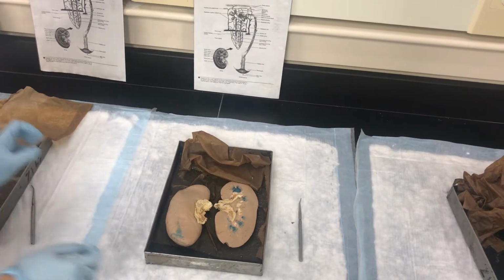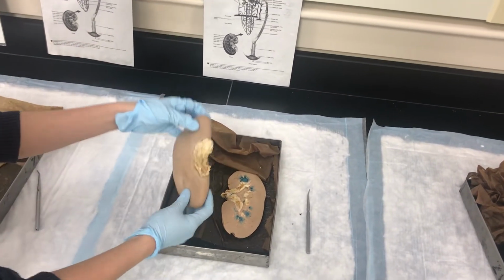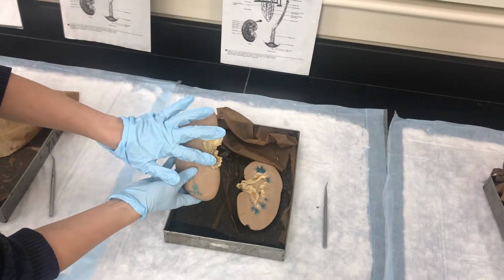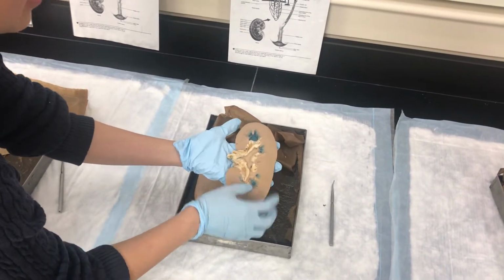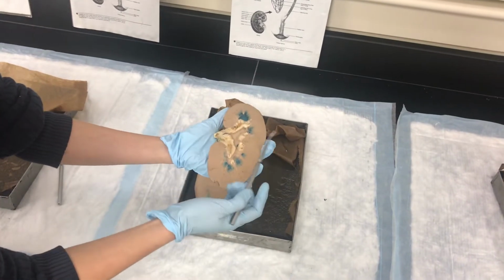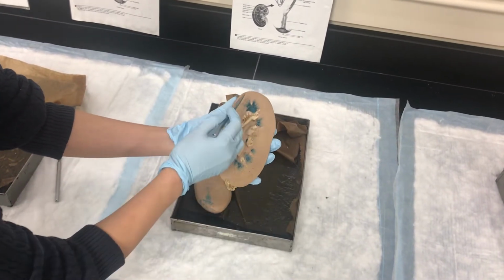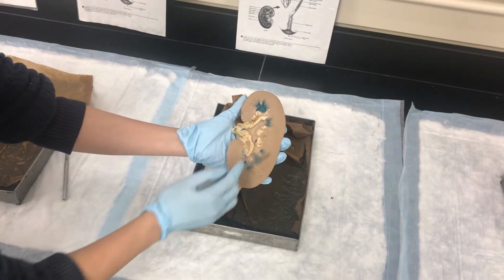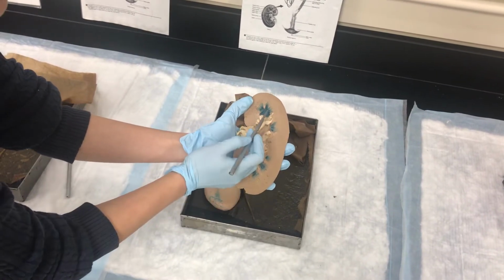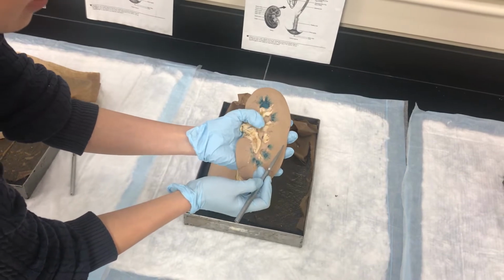So here's our kidney dissection, and here you can see a whole kidney. You can see the hilar fat pad right there. It's super, super dense. And then what you can also see are the 3 different layers of the kidney. The outer layer, that cortex part, is pretty solid, and then the medulla is the middle layer, and then you can see here the pyramids in the medulla.